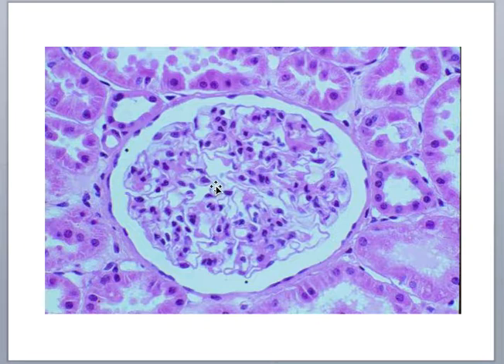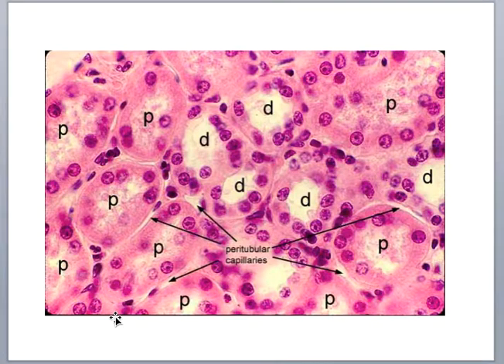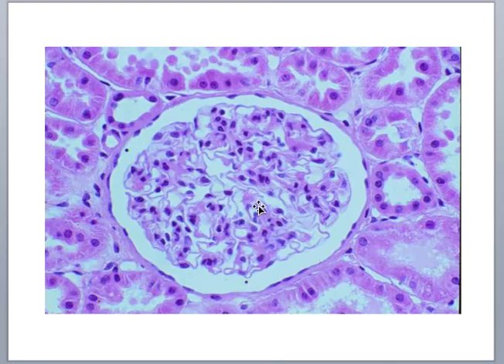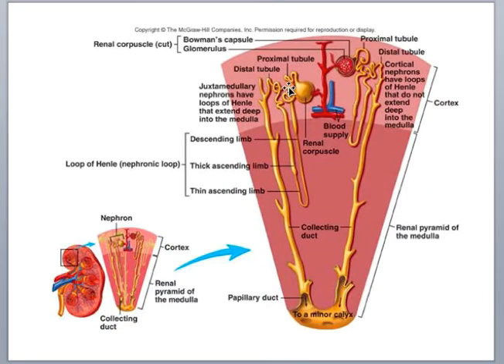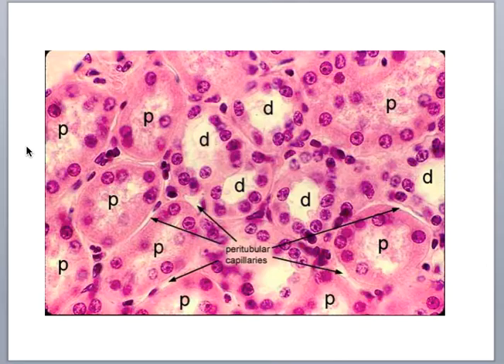If I have a pointer in this structure and I ask, what is this entire unit called? You would tell me a renal corpuscle of the kidney. So you should be able to tell me the difference between proximal and distal convoluted tubules. If you want to find proximals and distals, this image doesn't show it, but they'd be very close to these renal corpuscles, because again, proximals, distals, and renal corpuscles are all in the cortex. So they'll be very close to one another.